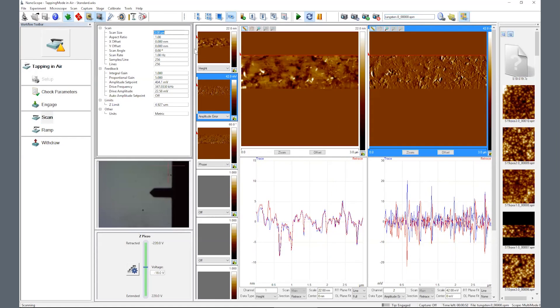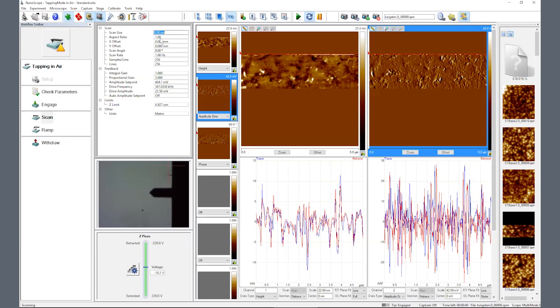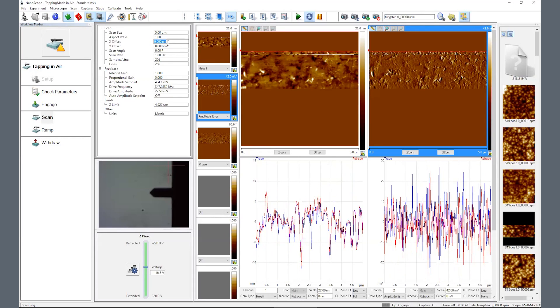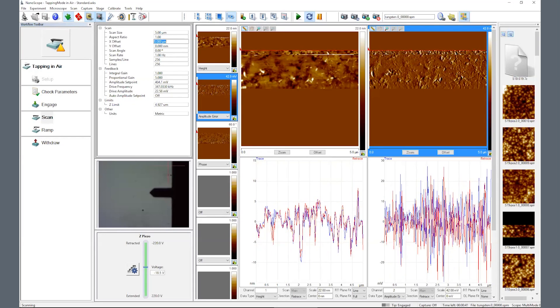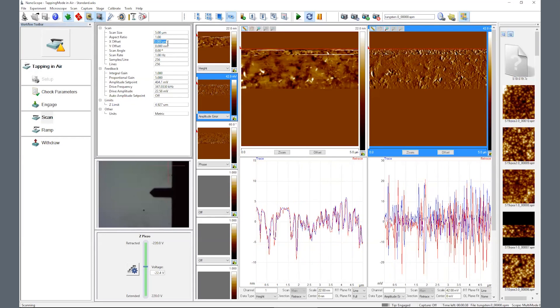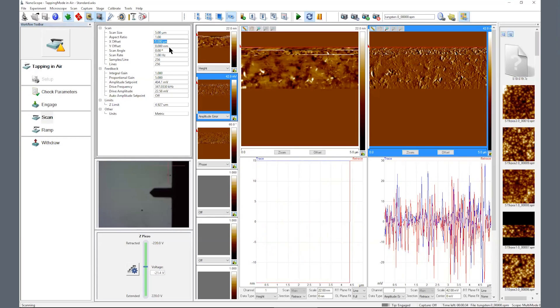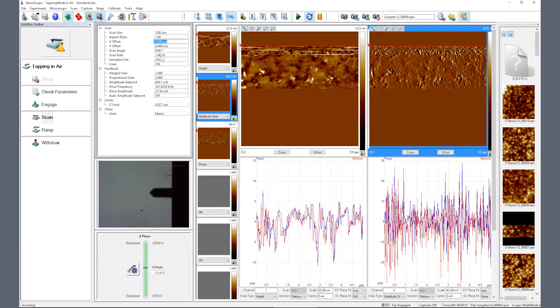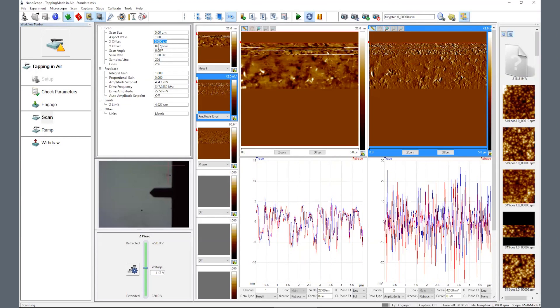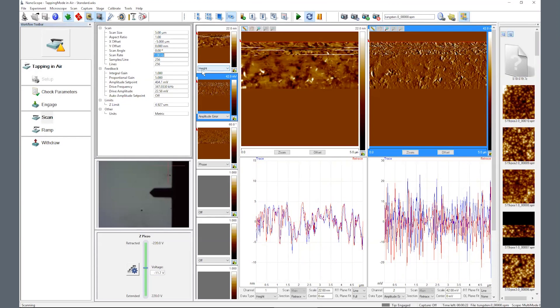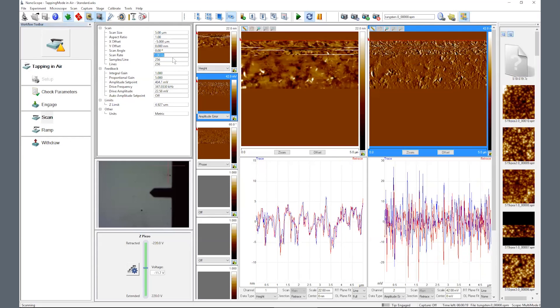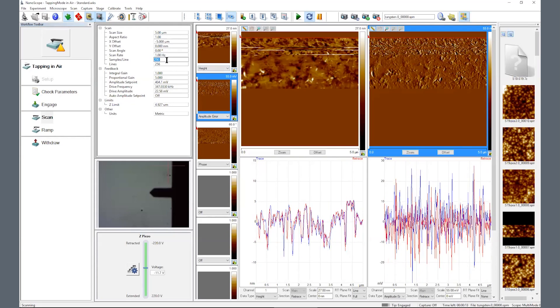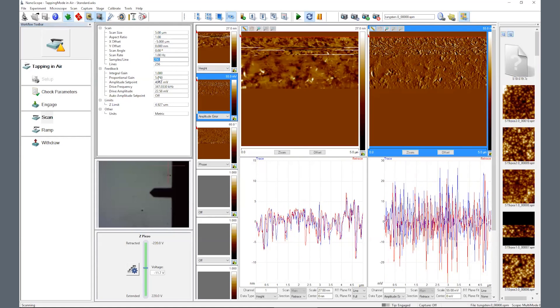You are now able to adjust your area of interest by changing scan size, X and Y offsets, and scan rates. Generally, 1Hz works well for scan sizes below 10 to 15 microns. You must slow it down for larger scan sizes.